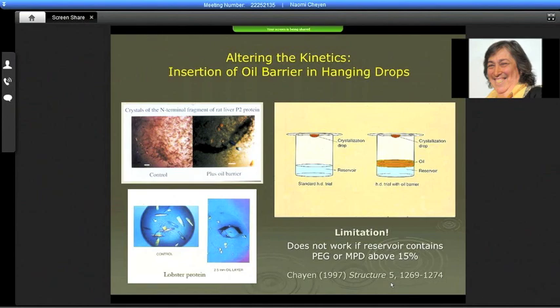So that is easy too. Or you can change the oil layer, it doesn't have to be half a mil, it may be maybe 300 microliter. Of course, you can only do this manually, but this is optimization, when you've got the conditions, so it doesn't matter to do it manually.